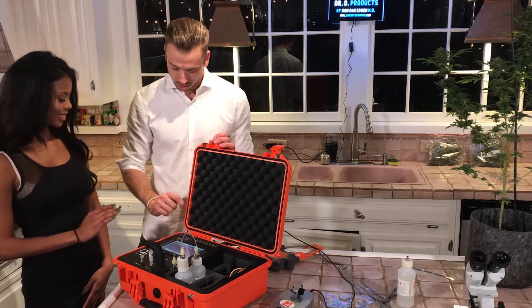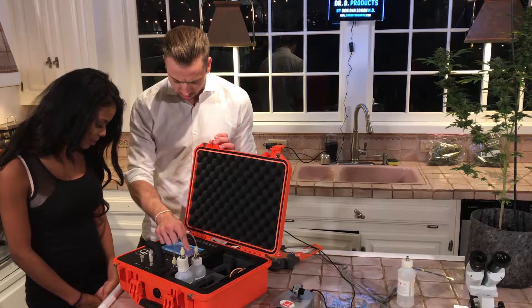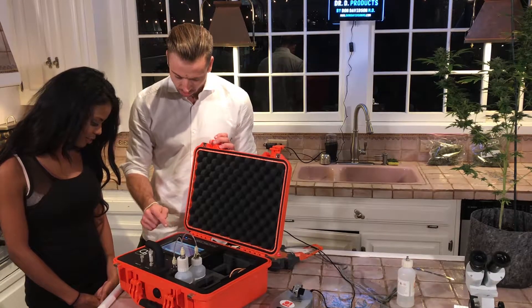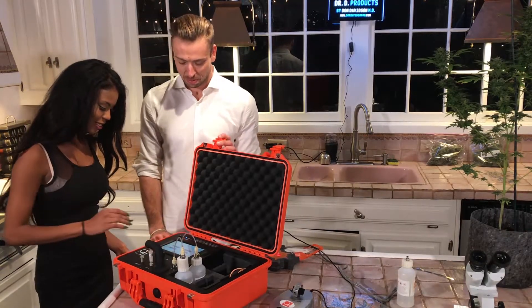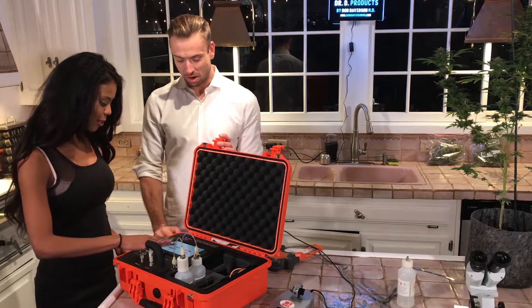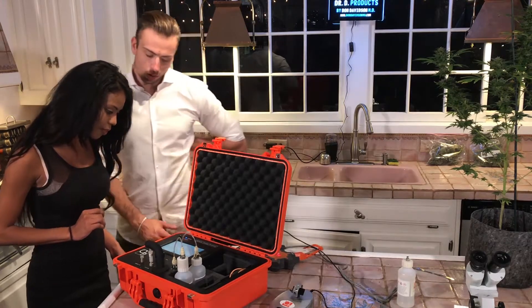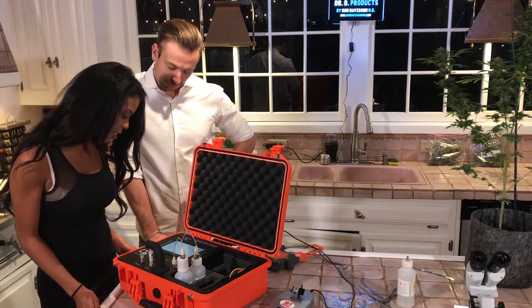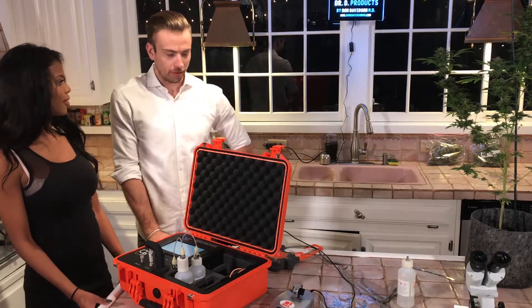Go ahead and put in 'one-one,' then press save. Press the next button. It now says step one: prepare at least 100 milligrams of the sample.